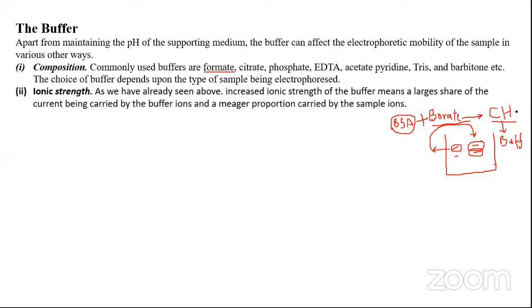The only point of caution here is that you should not be interested in the molecule after separation. Because if you want the separated molecule to be purified later, then it will be of no use, because it has already undergone chemical modification. So first of all, how do you choose the buffer? I have made it pretty clear, I believe, on what basis you choose the buffer. And two, it should be non-interacting.